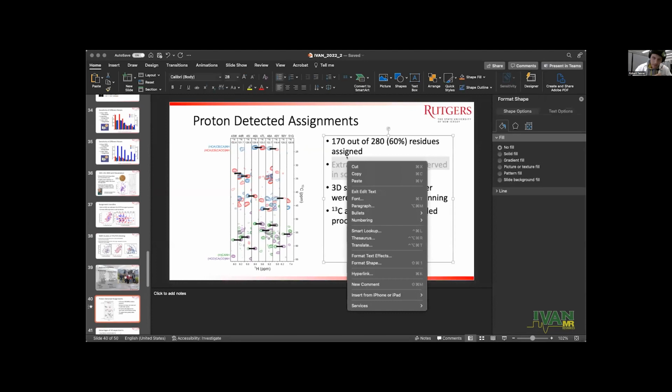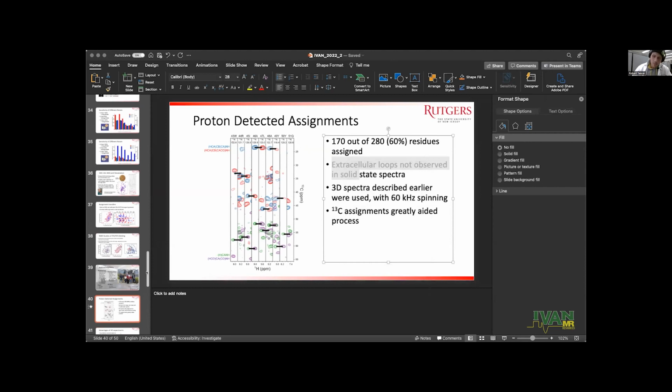I've got a question. Thank you very much, Andrew, for the excellent talk. And I was wondering if you could just comment on when would it be advantageous to use your solid state NMR as opposed to something like RCSA, residual chemical shift anisotropy?